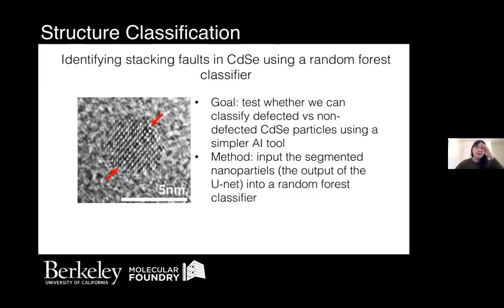And finally, just to round out this discussion of our two-step pipeline, I wanted to show results. Once we have segmented our nanoparticles, we are free to put those segmentation maps into existing tools that are part of scikit-image, for example, the Python package, which can immediately tell us size and shape characteristics like aspect ratio, and can summarize those statistics for us on a particle by particle basis.